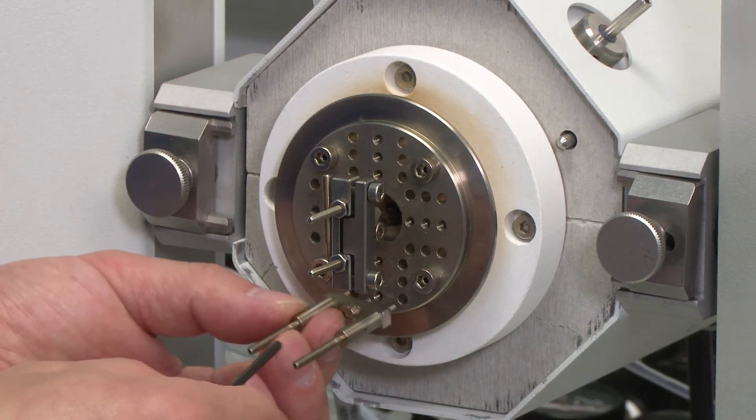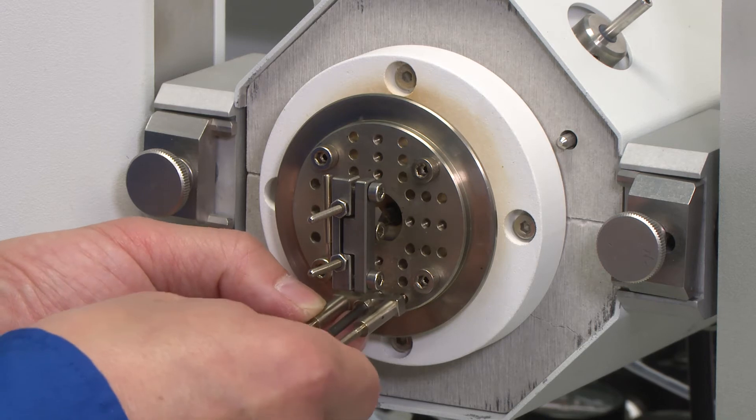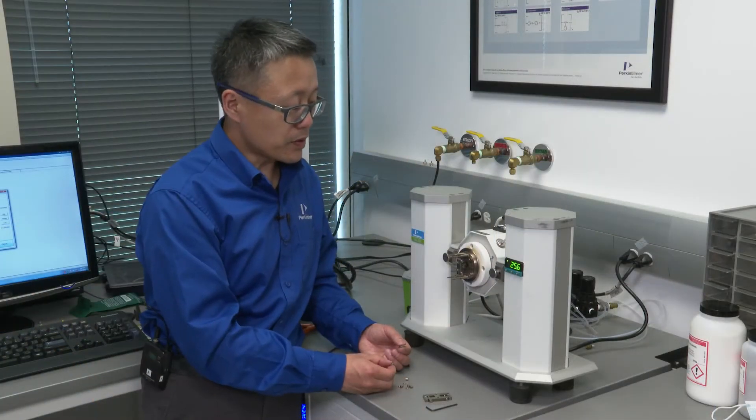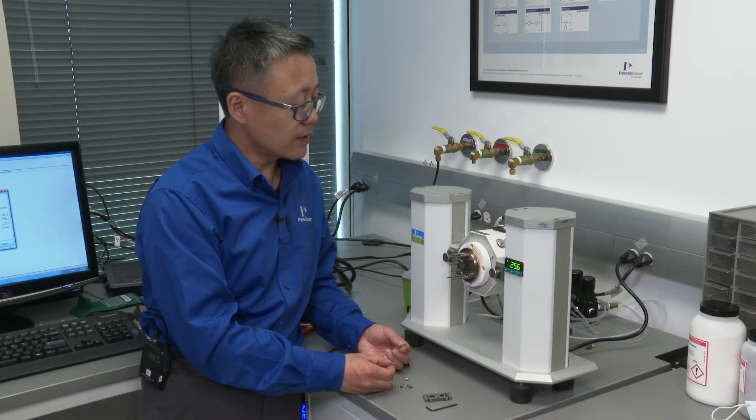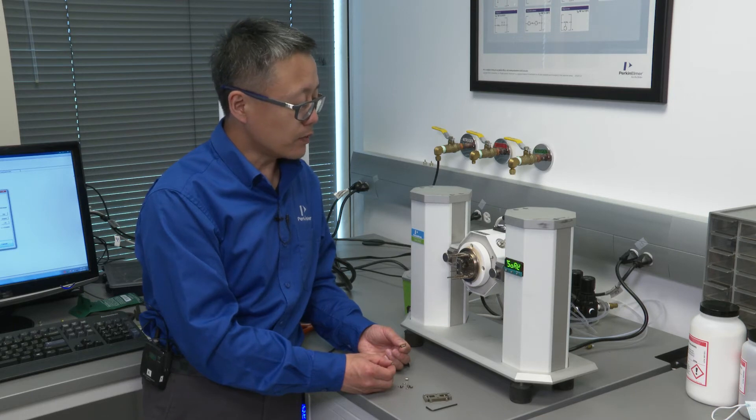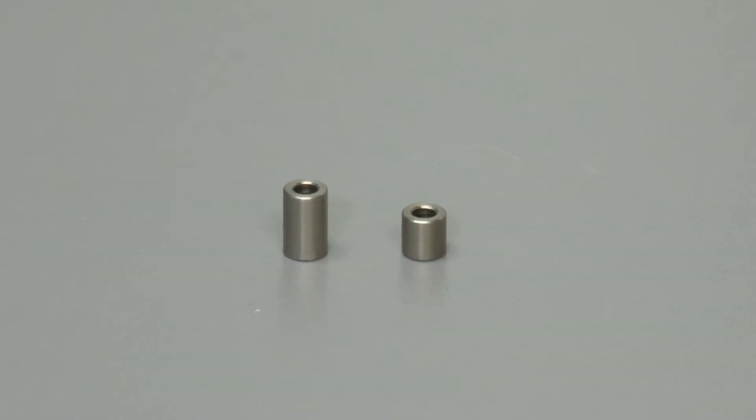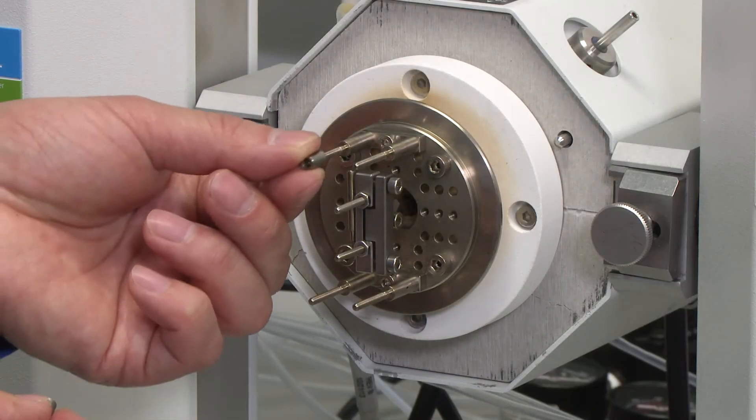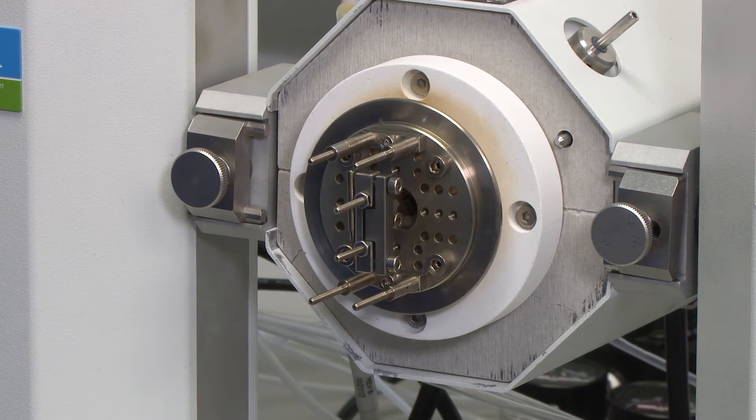Then we install the fixed pillars. There are two spacers with different lengths. Based on the sample length, we can choose this long one or the short one, or the combination of the two for the longest sample, which is going to be 10 millimeters long.